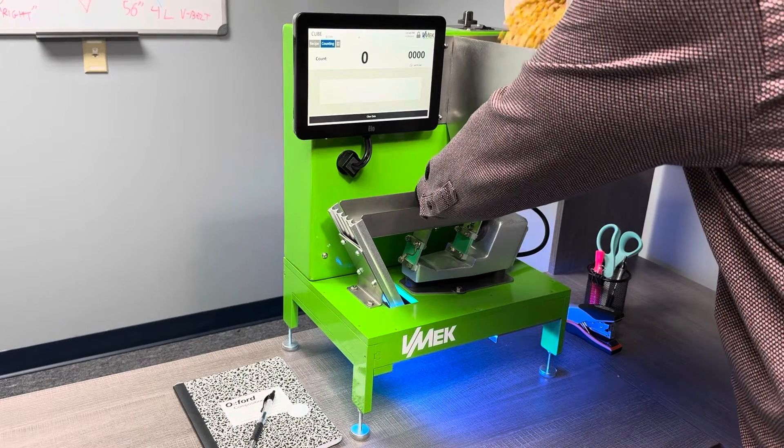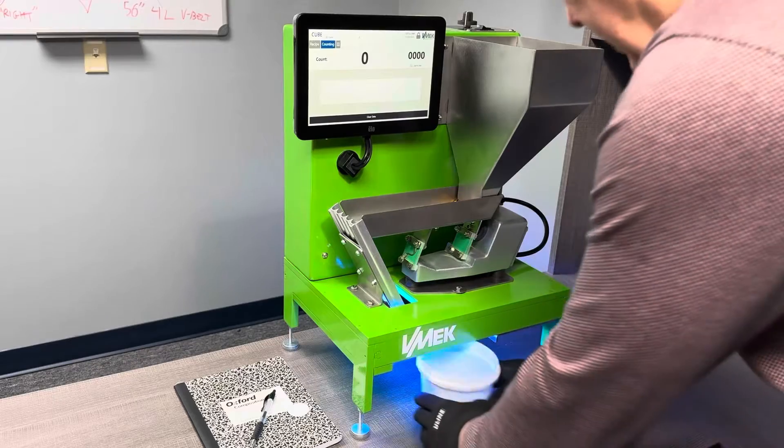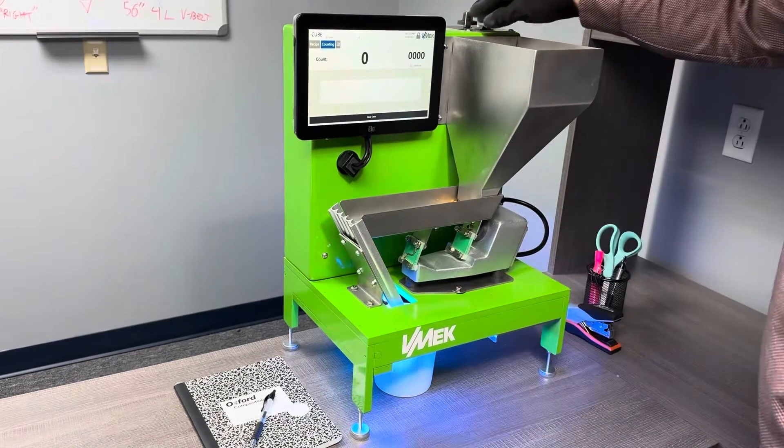Simple to operate — just pour the sample and turn on the feeder, and it starts counting.